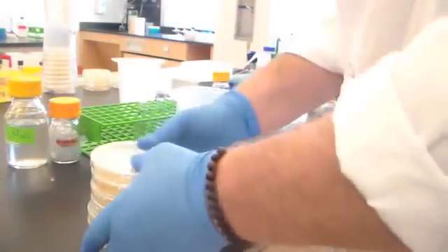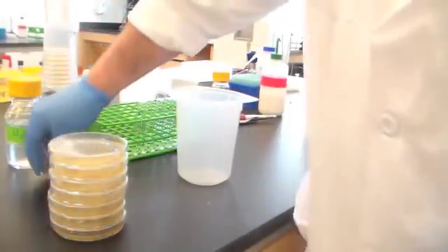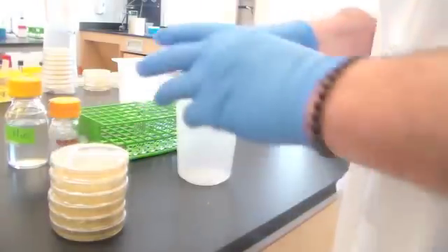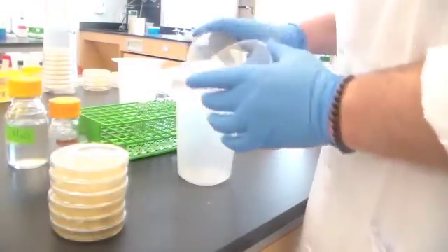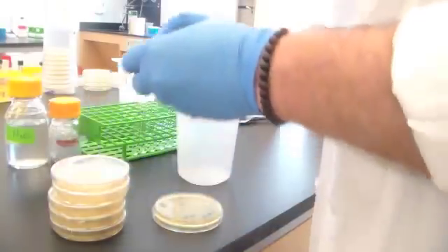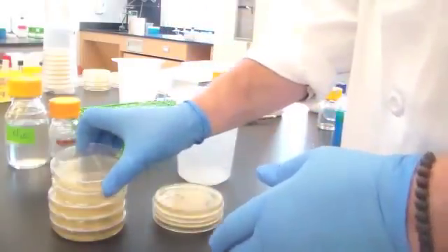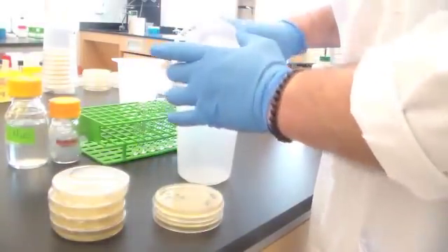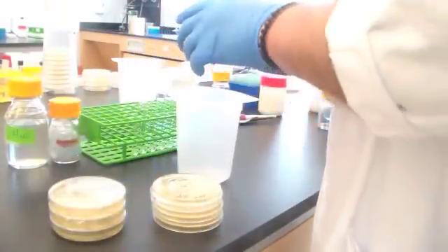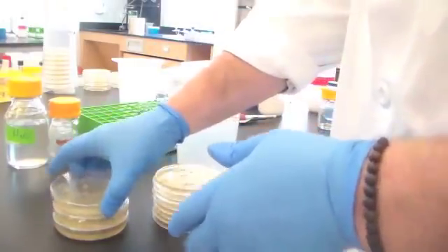that plate. Now, these are those little beads that escaped me. I'm going to put them in here because this is where I'm going to add all of these contaminated beads. We're going to put alcohol in. You'll actually be dumping yours into an alcohol vat to disinfect beads that will eventually get cleaned and autoclaved, thanks to the hard work of your TAs.